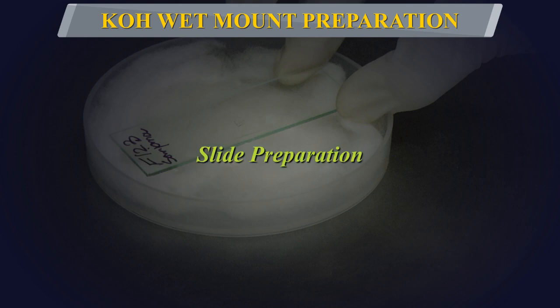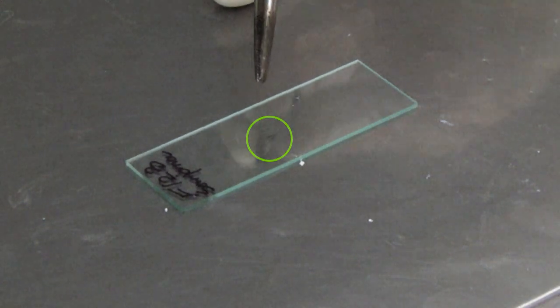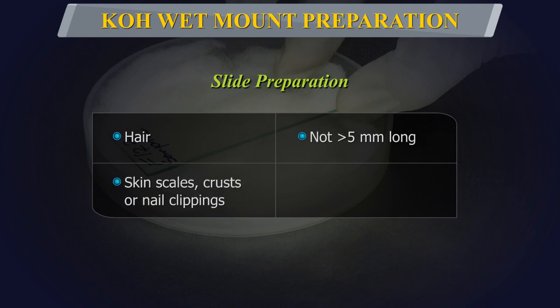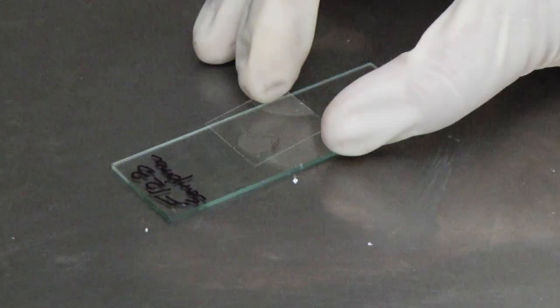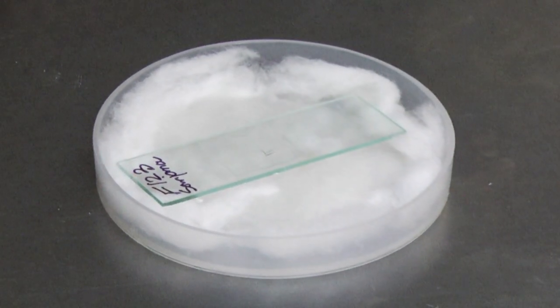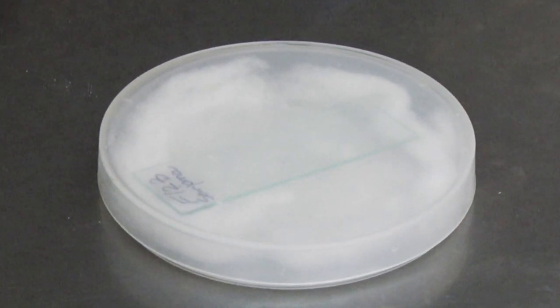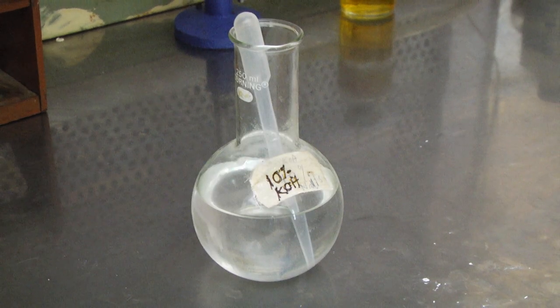Slide Preparation: Transfer the specimen with the help of sterile forceps onto a labelled slide. For better clearing, hair should not be more than 5 mm long and skin scales, crusts or nail clippings should not be more than 2 mm across. Add a drop of the potassium hydroxide solution on the specimen and cover with a cover slip. Place the preparation in a sterile petri dish lined with damp cotton wool or filter paper to prevent drying out.